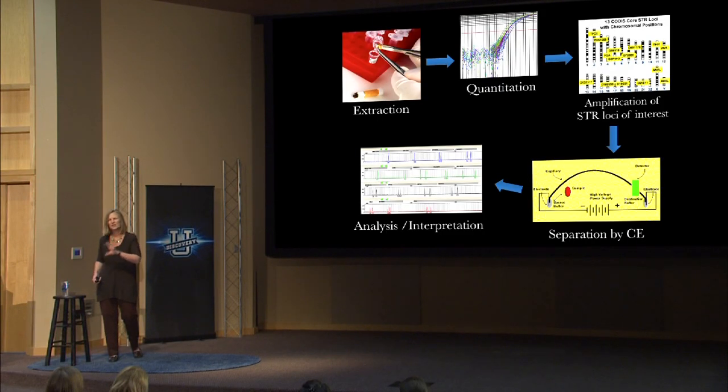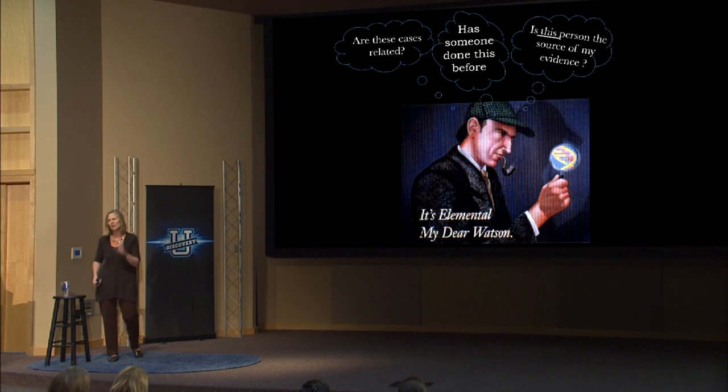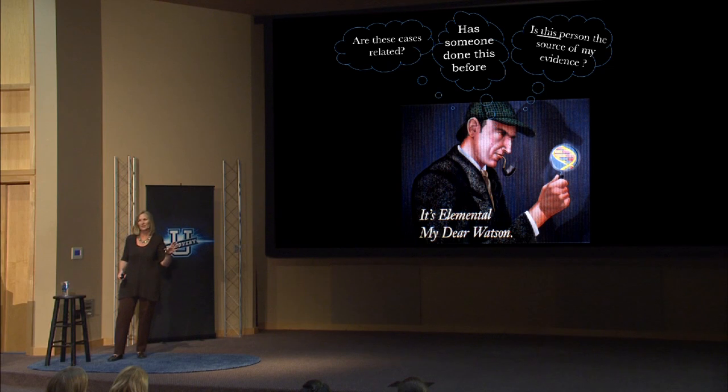So we do this STR typing. We look at targeted regions. We can take that information. We can put it into CODIS. So the PCR testing method now takes us about 1 or 2 days to complete. We still have some questions left to answer, though.